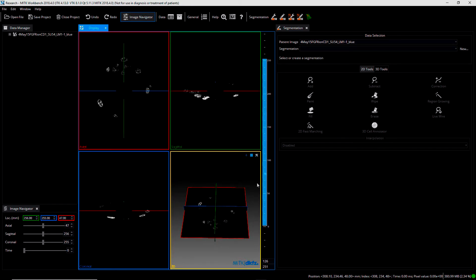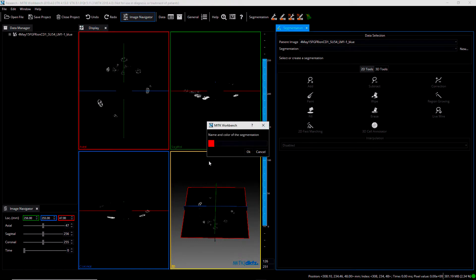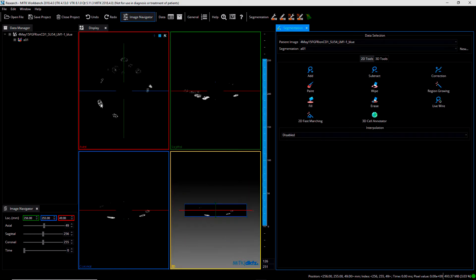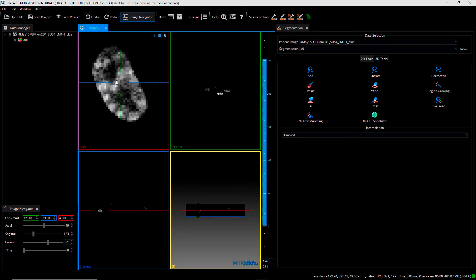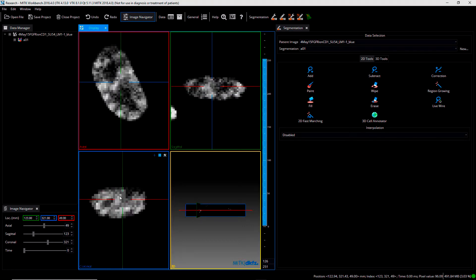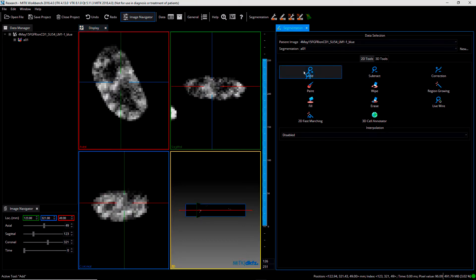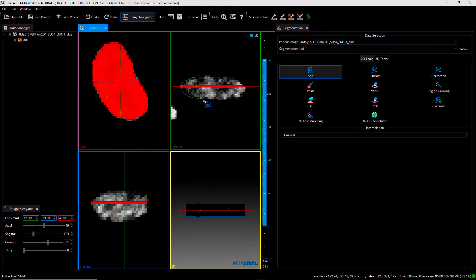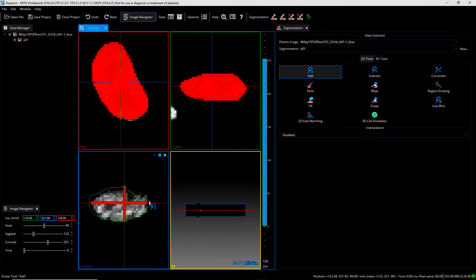Let us open MITK and load the dataset. MITK provides several views to thoroughly explore the dataset. To segment a single object, just use the segmentation menu and create a new label which then identifies that cell. With the Add button, you can quickly create an initial contour needed for 3D Cell Annotator. Just a few seconds are needed to create the initial contour for each object to be segmented.